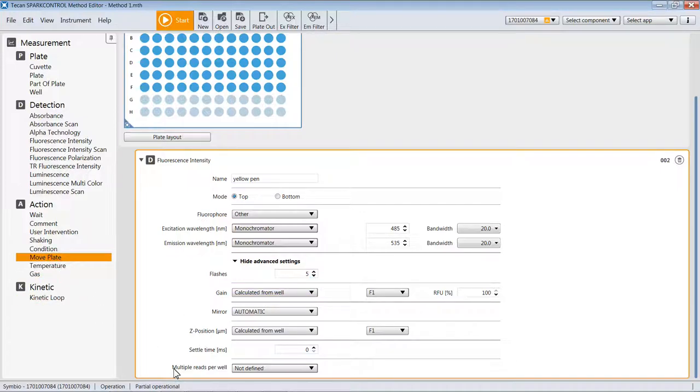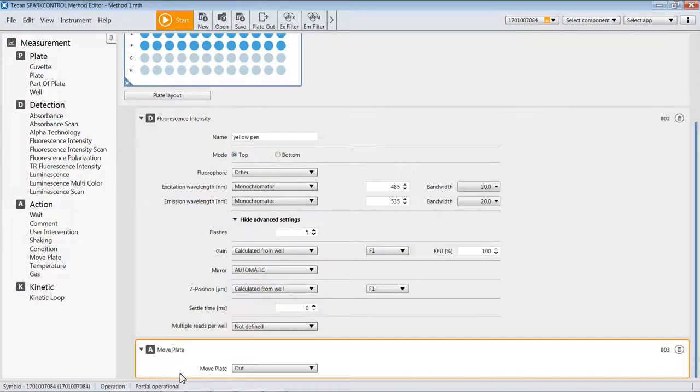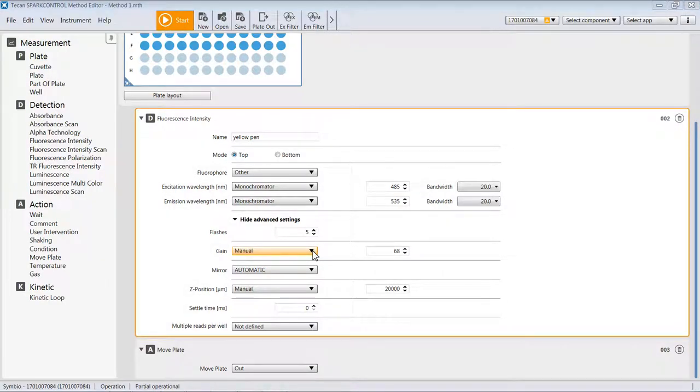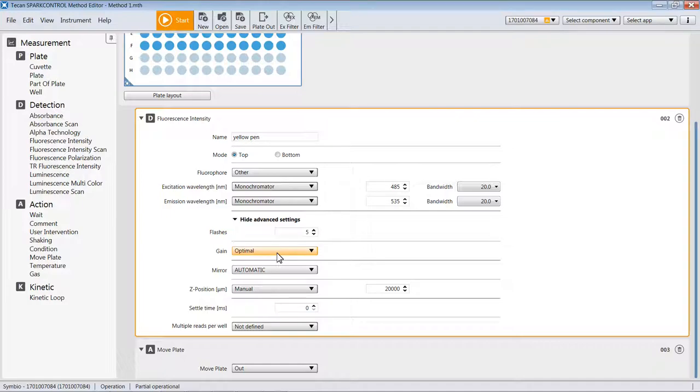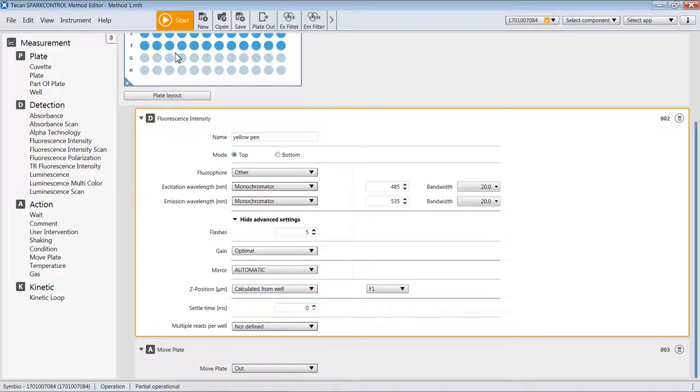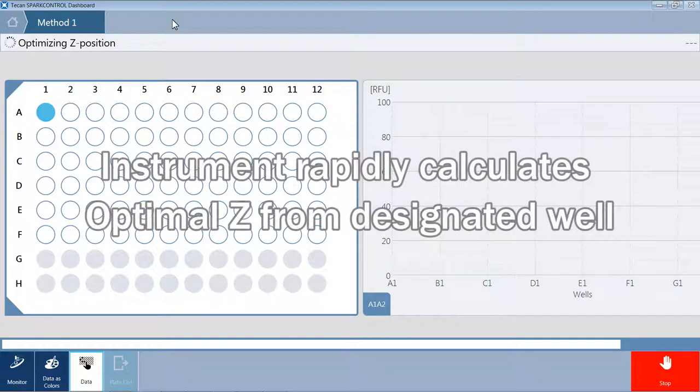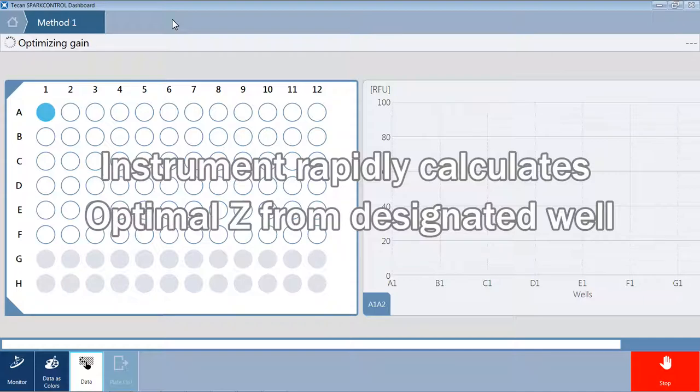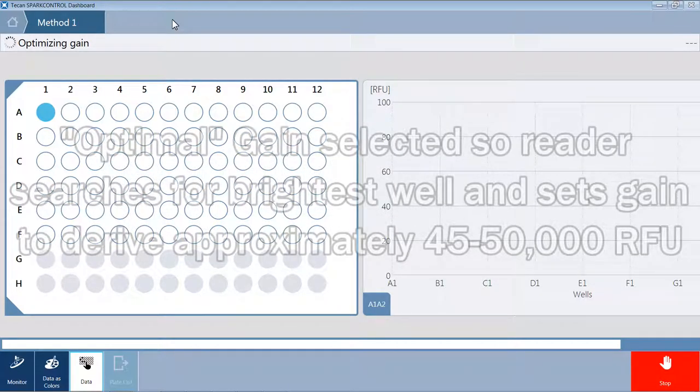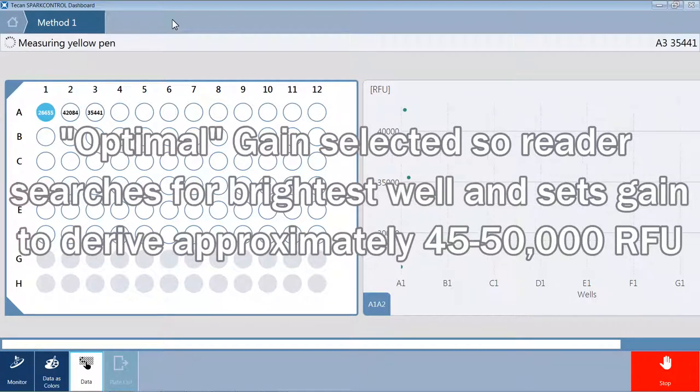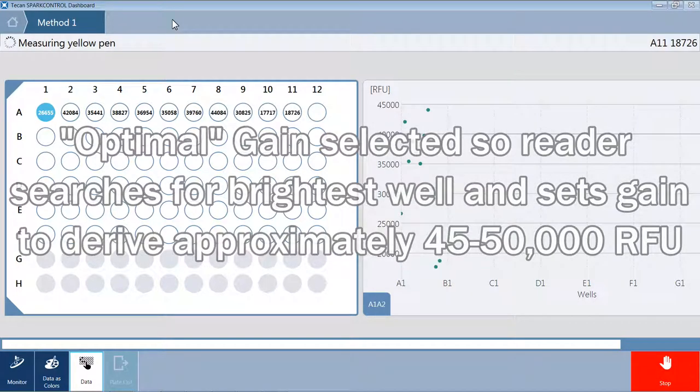We will also drag and place a move plate out step into the protocol. This example will also go back to having optimal gain as the setting and calculate Z from well F1. With that, we can go up here and press start and collect our measurement. The instrument will first go to well F1 and determine the optimal Z distance at which to focus. It will use that distance for measuring all the wells. It will also optimize the gain by finding the brightest well, setting the gain to make sure that well has 45,000 to 50,000 RFU, and it will use that gain to read all the wells in the plate.